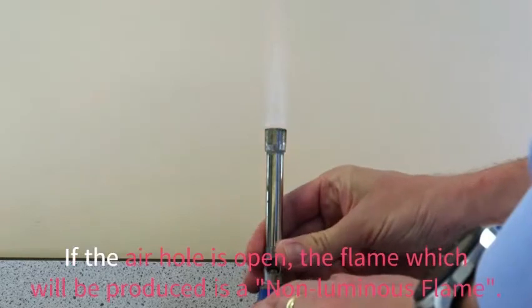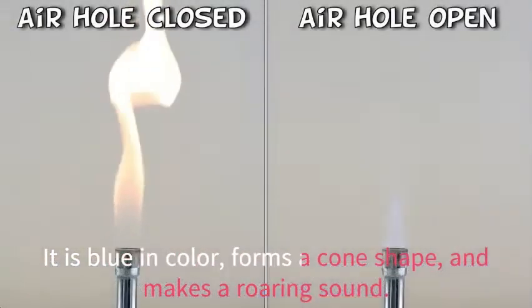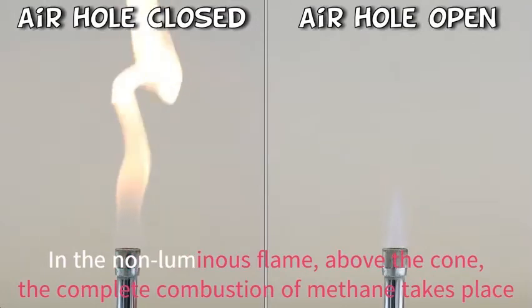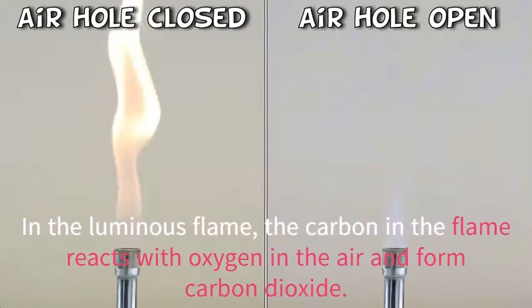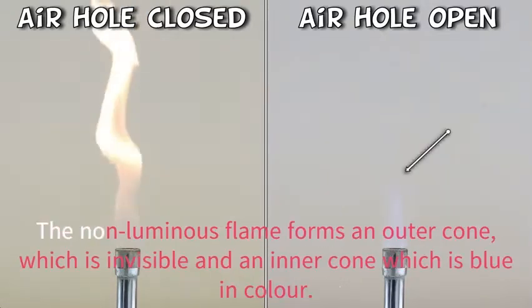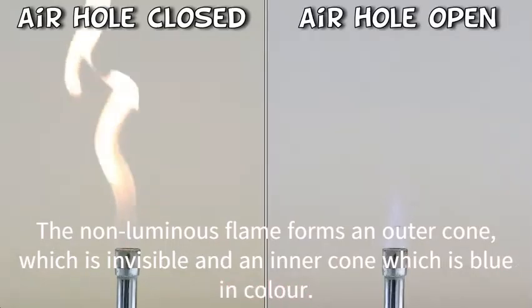If the air hole is open, the flame which will be produced is a non-luminous flame. It is blue in color, forms a cone shape, and makes a roaring sound. In the non-luminous flame, above the cone, the complete combustion of methane takes place. In the luminous flame, the carbon in the flame reacts with oxygen in the air and forms carbon dioxide. The non-luminous flame has an outer cone, which is invisible, and an inner cone, which is blue in color.